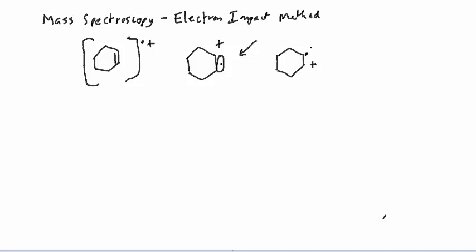And basically in this fragmentation, it's a bunch of homolytic bond cleavages that occur. So let's start with the odd electron. We're going to shift it to the adjacent bond. Remember, when one electron moves, that's a half-headed arrow. This bond here is going to homolytically break, so one electron from that is going to come over like that and meet this first odd electron, forming a pi bond there. The remaining odd electron comes over and resides on that bond.